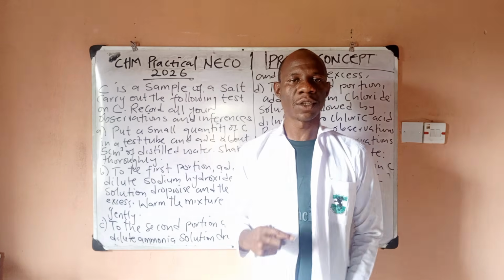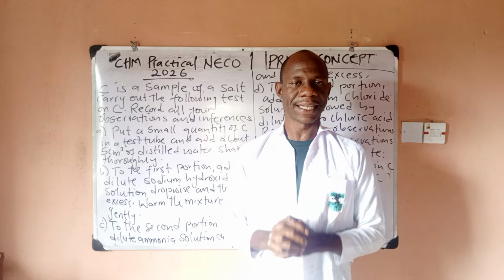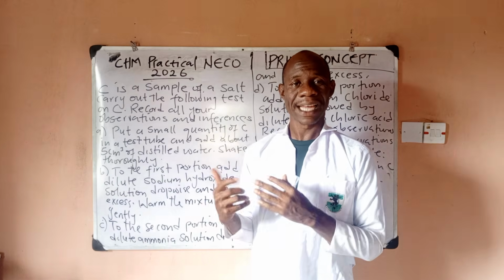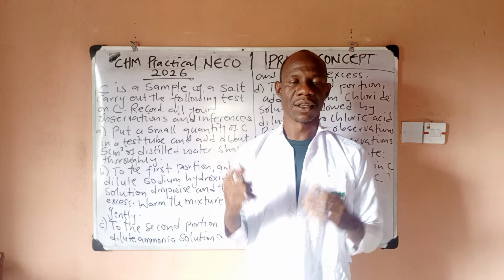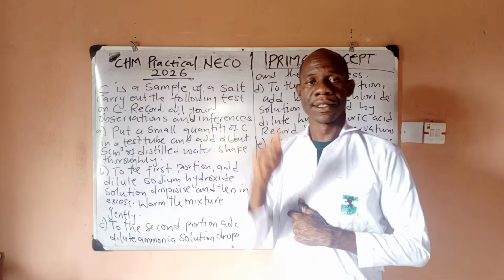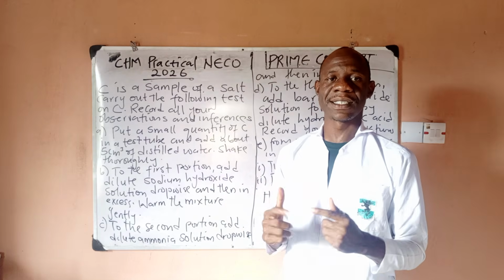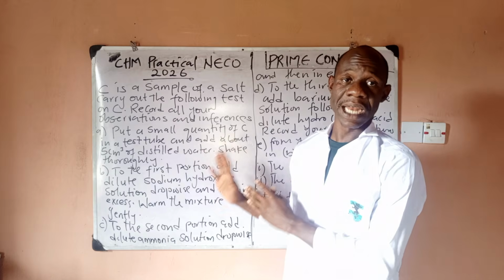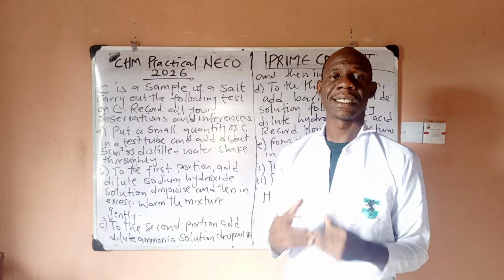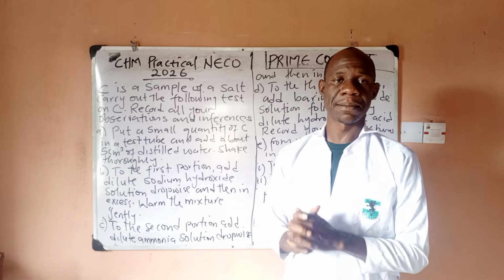In this video, I want to prepare you for your NECO 2026 practical chemistry salt analysis specifically, and we want to carry out the experiment looking at a sample of what NECO is likely to bring on your exam day. I've drafted a sample of how the question would look on that day. I would advise you to use this video and practice because I predict that the question will come in this similar way. I'm going to show you how to perform the experiment live and then how to write your report. I'll give you the report that you will be using on the day of your exam and it will guide you.